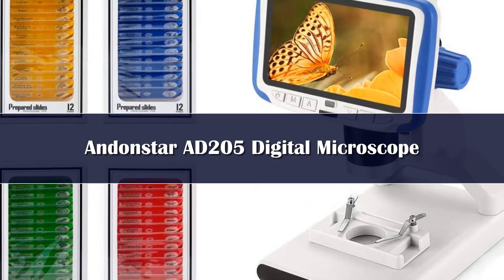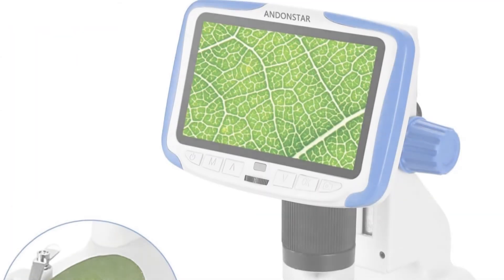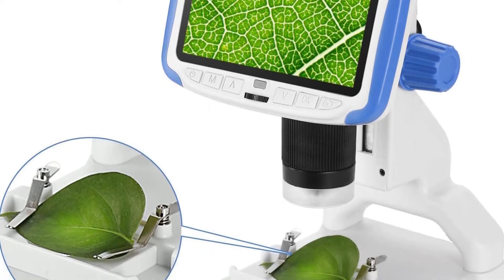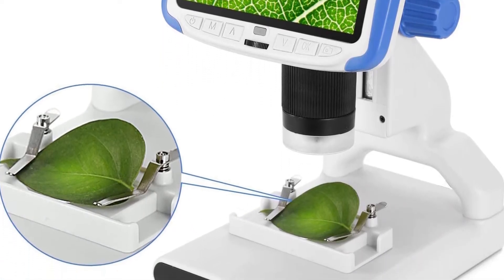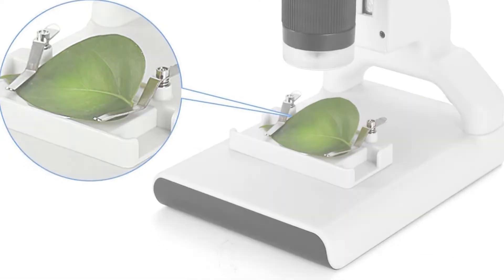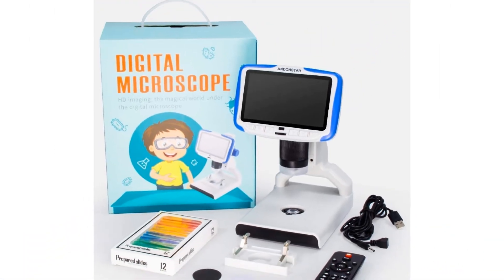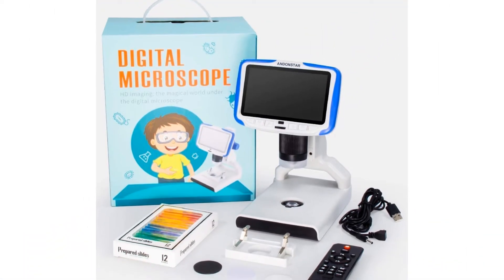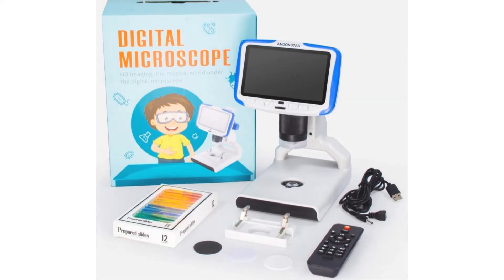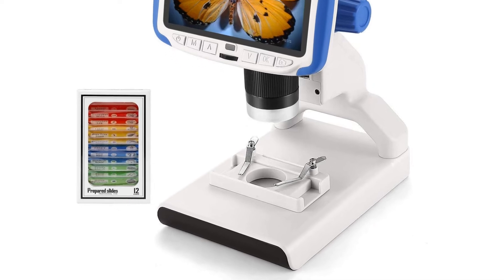It comes with a green veggie slide kit including cabbage leaf, ginger root, potato starch, lachu root, cucumber ovary, pumpkin ovary, sponge gourd stem, carrot root, corn stem, burtok root, celery leaf, and onion epidermis. A red insect slide kit includes butterfly wing, butterfly antenna, butterfly leg, locust wing, locust antenna, locust leg, dragonfly wing, dragonfly abdomen, dragonfly leg, honey bee wing, honey bee antenna, and honey bee leg.